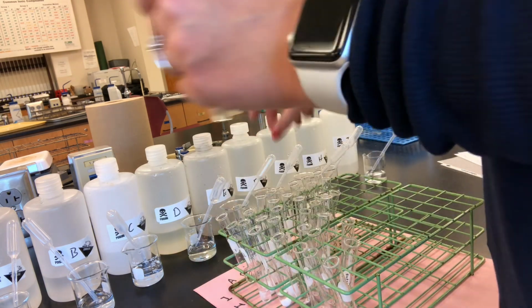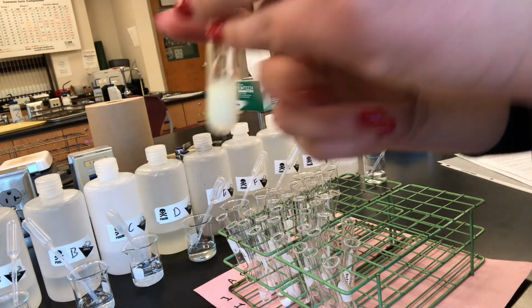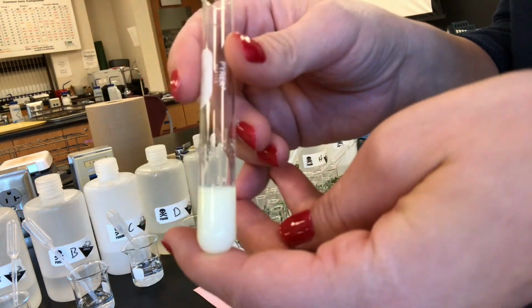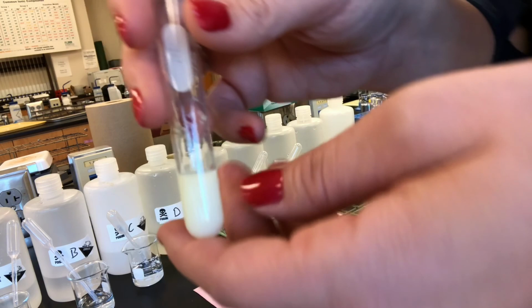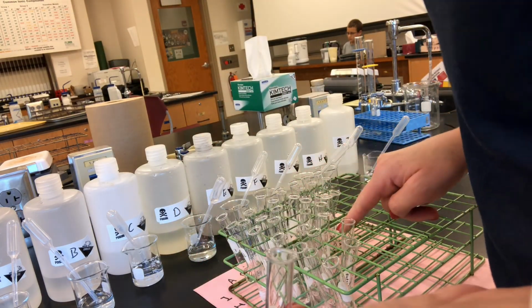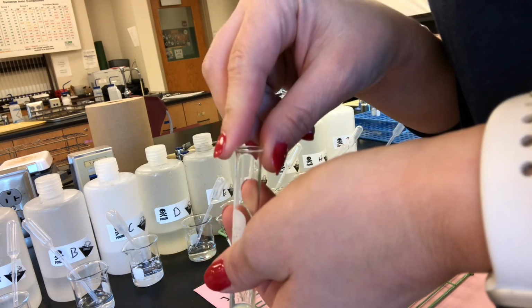And D and E. Oh, there we go. I knew we'd get a colored one in here. D and E. I'm not sure that this color change is coming across well on the camera, but we definitely have a color change. It's like a light, pale yellow precipitate formed. So the only one we got action on there was D and E. We got a pale yellow precipitate that was formed.